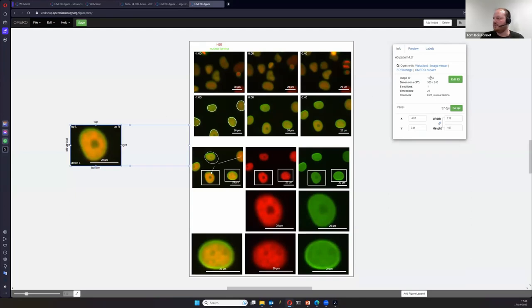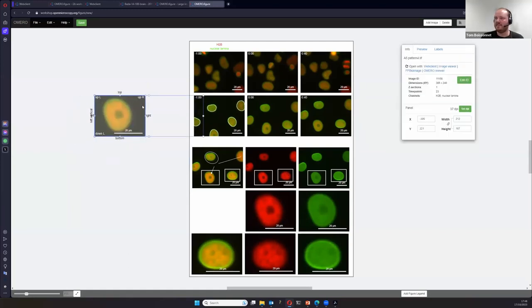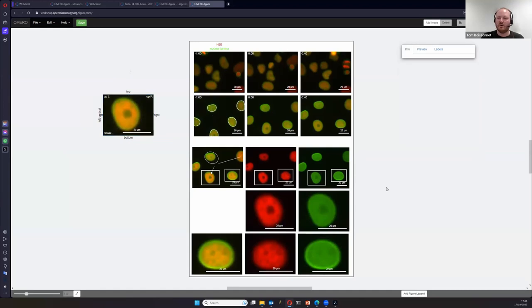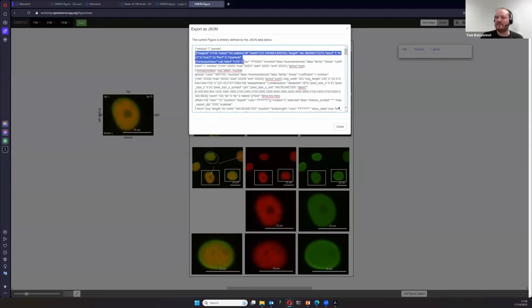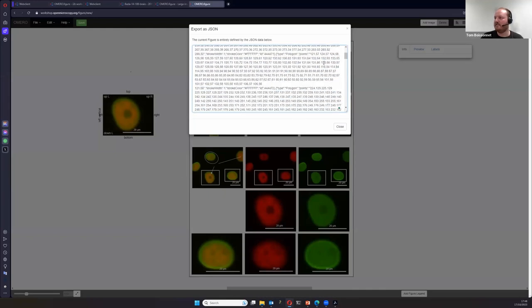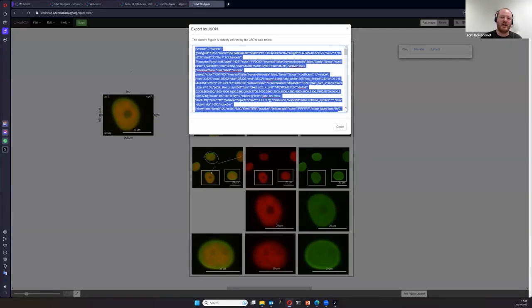As I showed earlier, there's also the functionality of replacing an image by another. In the advanced details of OMERO Figure, what we are changing when working with this is only JSON. If you go to File → Export as JSON, you have here the description of your figure — the image IDs to open, name, width, position on canvas, what labels should be shown, what ROIs. Your figure is actually just a JSON description of how to display the images. This is what happens when you share a figure: OMERO reads the JSON description, then loads the images from the server — it's not saving pixels, just the textual description. This also means you can edit the image ID to replace one image with another in the JSON, making it possible to use a figure as a template and reuse it with different images.